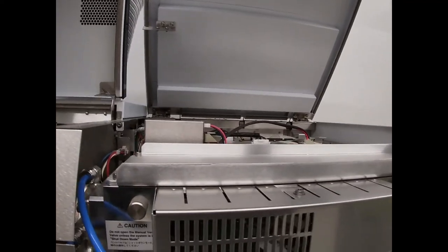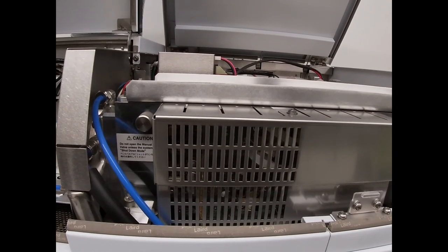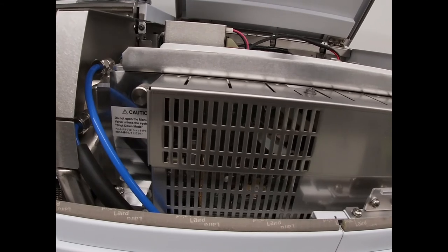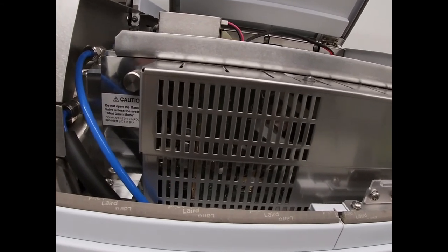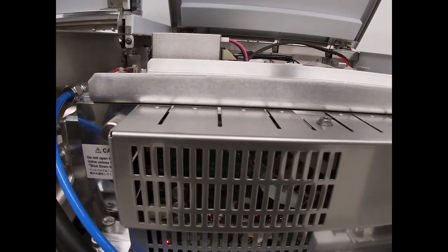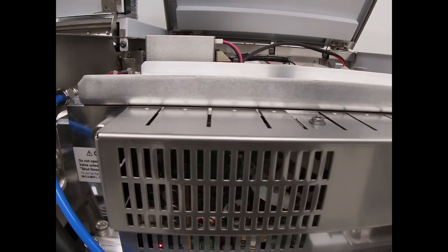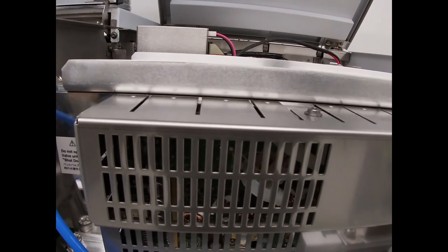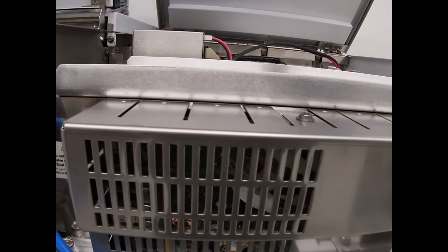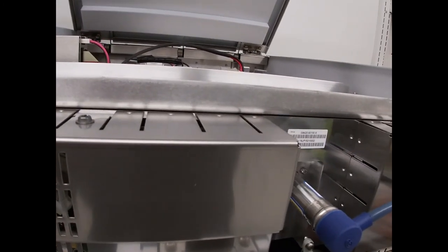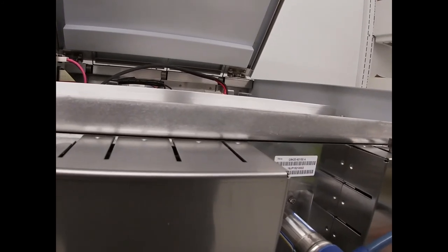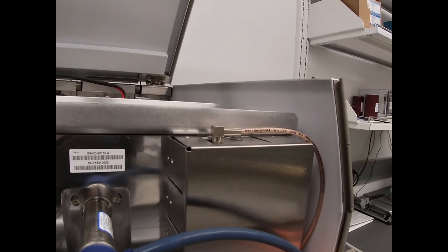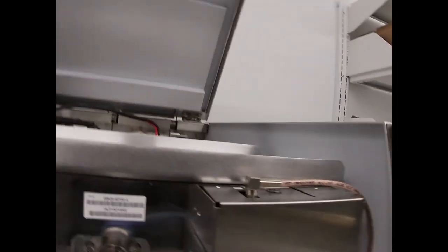So in here is our mass spectrometer and collision cell. It's all encased inside our vacuum chamber so you can't actually see them. But our octopole is a collision cell that is pressurized with high purity helium. There's our helium tank right there. We can actually tamp down the energy of some of the ions to collision or break up any molecular ions so that we can reduce background. So once our analytes leave the collision cell, they then move toward a quadrupole mass analyzer, which is actually what separates their isotopic ions of our elements. And then ultimately those that make it through as we scan go to an electron multiplier, which is our detector.